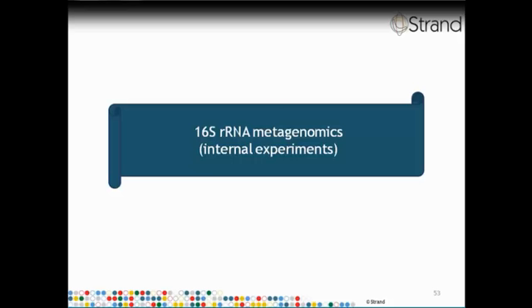We've also done some preliminary work on viewing de novo assembly results. The MiSeq software uses Velvet to carry out de novo assembly. The result of the assembly is a set of contigs and reads which align against those contigs. We have used the AMOS tool set to convert the alignment results into SAM format. Once we have the alignments against the contigs in SAM format, we can load all the different contigs as different pseudochromosomes into the Genome Browser.